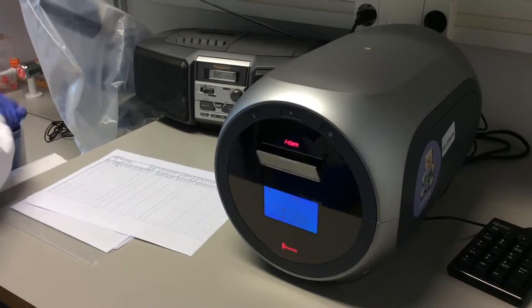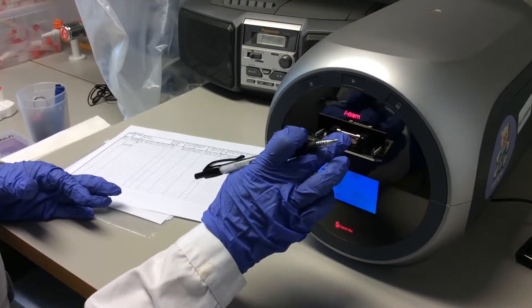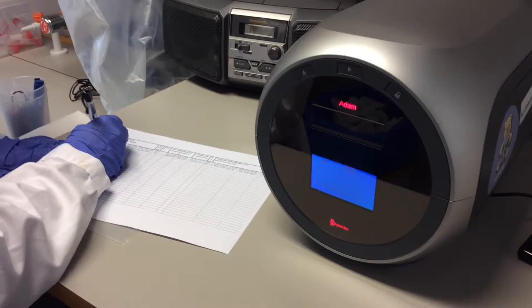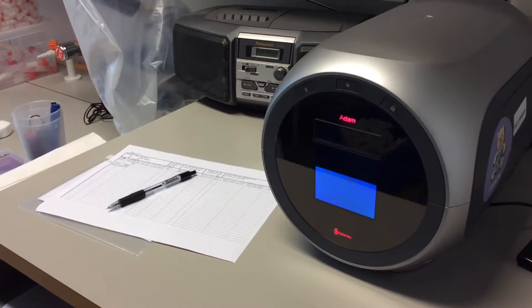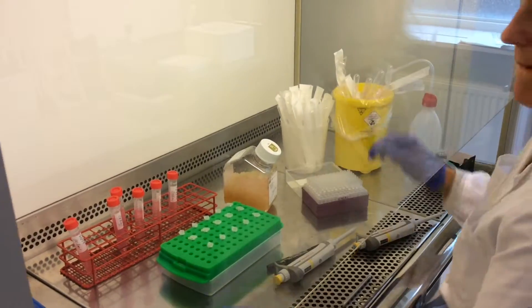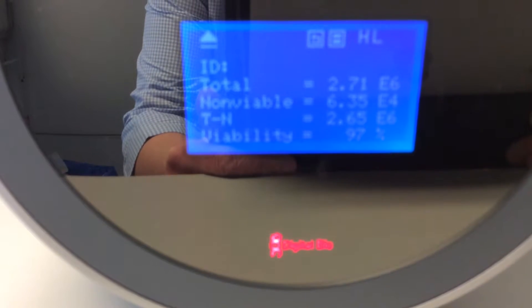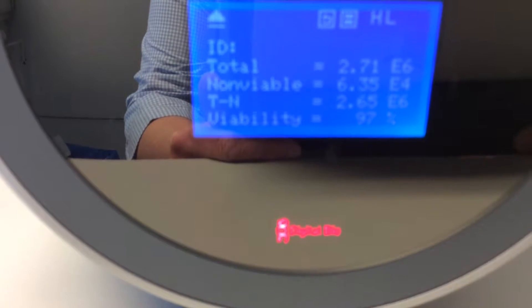This electronic device is called ADAM. She puts the slide into place and ADAM begins counting. While ADAM is doing the counting, Magdalena moves on to prepare the next sample. The result shows a total of 2.7 million cells with a viability of 97%, which is good.